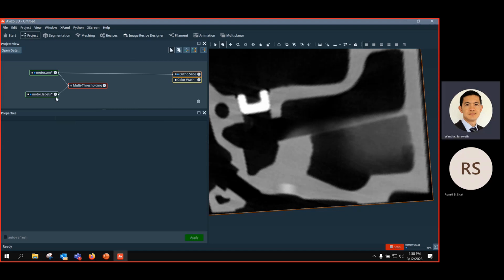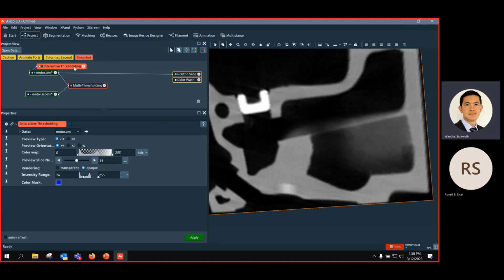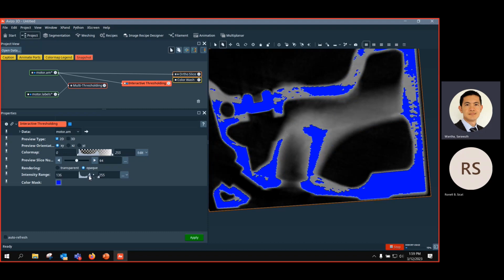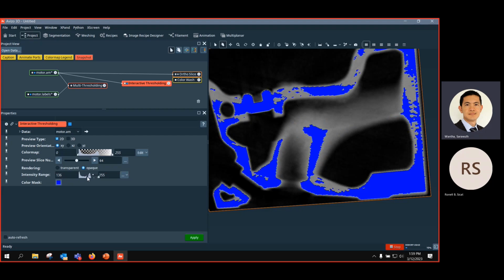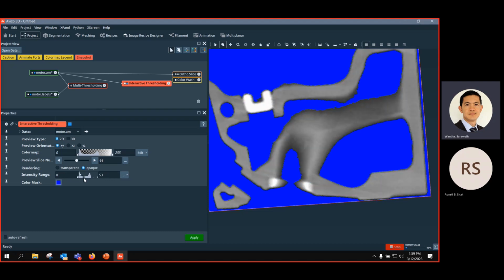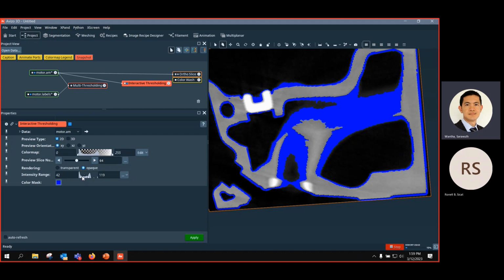Exactly. So it's your judgment if you want to separate them according to what you see, or you want to have your own reference. For example, I showed you now on the interactive thresholding. It's the same as you have interactive thresholding three times. So first time you need to adjust which threshold you are interested in. Like here, I want to have my first range, this one, and the second range I want to have somewhere here, and the third range I adjust the range again somewhere here. So it depends on how you define your range. Yeah, you can see it's subjective for one user to define the range of threshold.